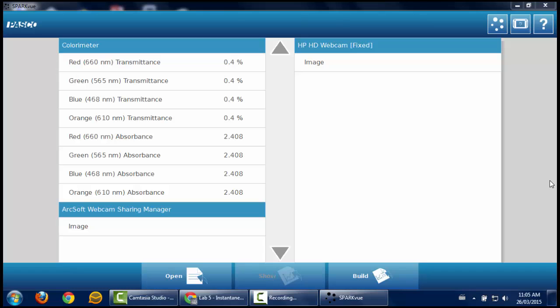So remember, zero the sensor with a blank, so put a cuvette full of water in it. All the absorbance should come out as 0 initially. They'll start to vary slightly afterwards, but make sure that you zero it right away.